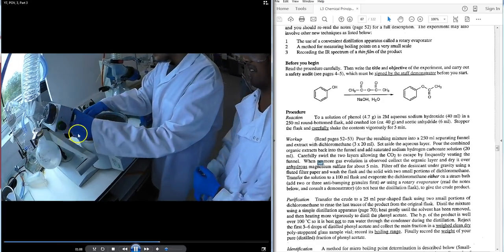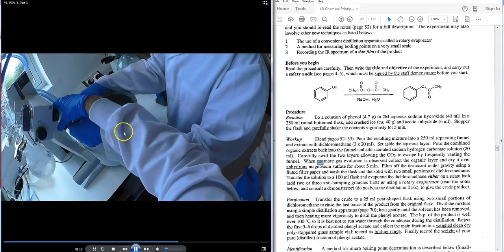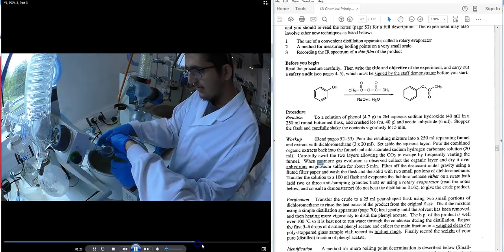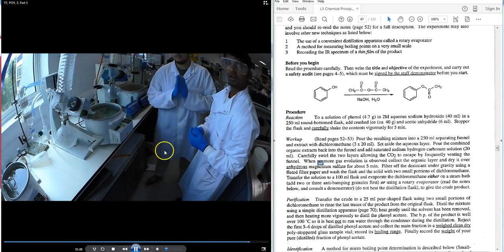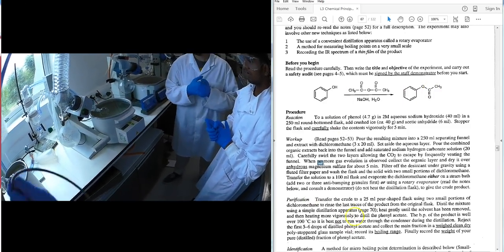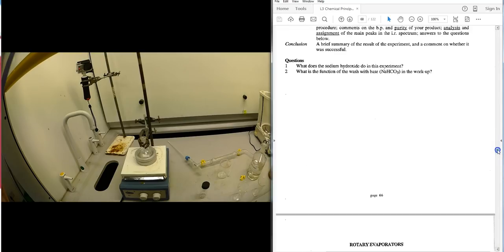The flask is clipped on, secured, and spun, then lowered into a thermostat-controlled water bath. The rotary evaporator spins the flask and removes the solvent, giving the minimum recovered mass of phenyl acetate. This crude material will then be purified by distillation, as described on page 70.